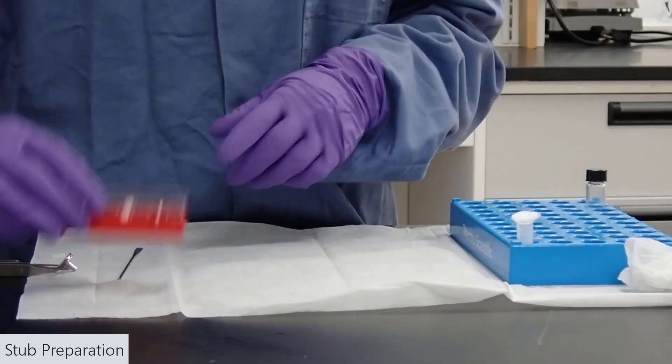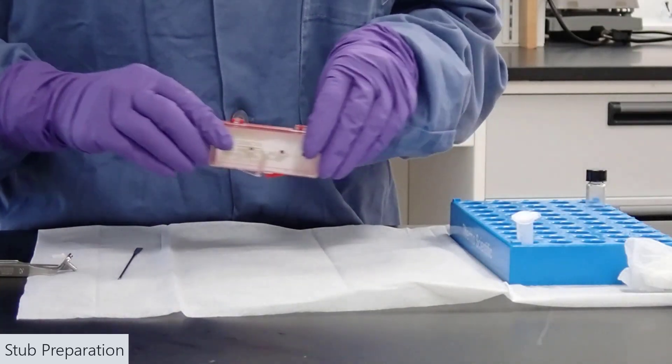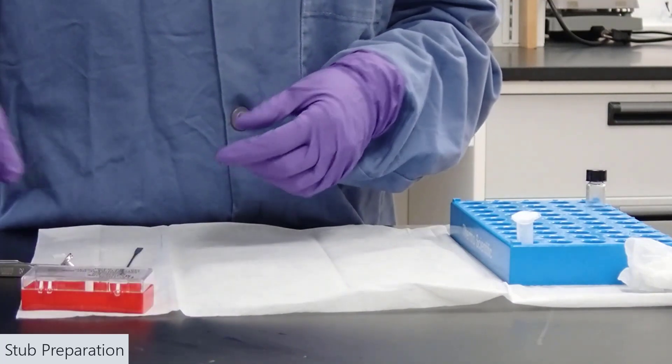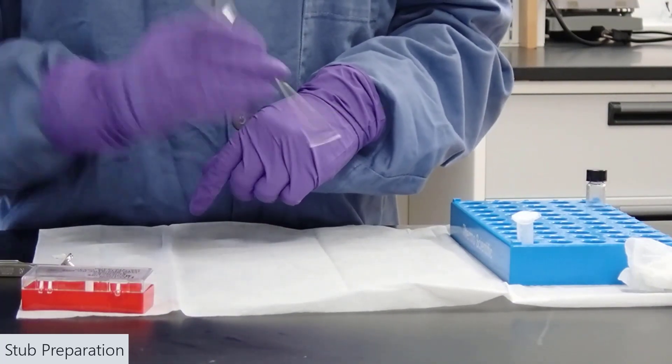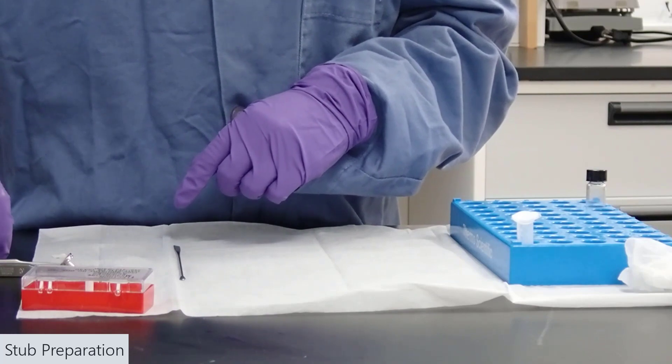So, to start, let's gather the supplies we'll need. A stub holder box is helpful to store our sample in. A little scoop—this one's metal. You could also use a wooden toothpick.